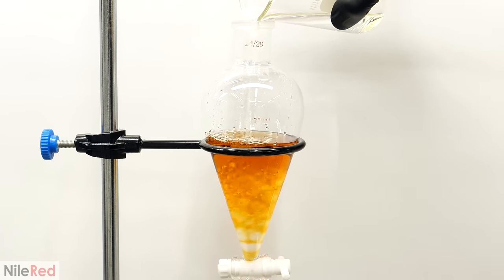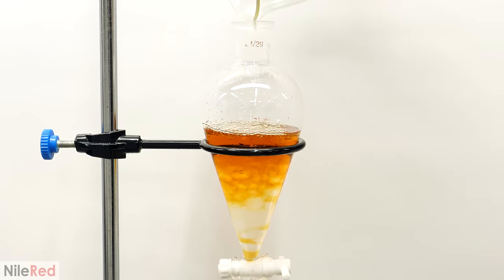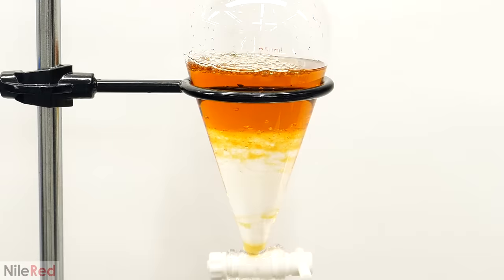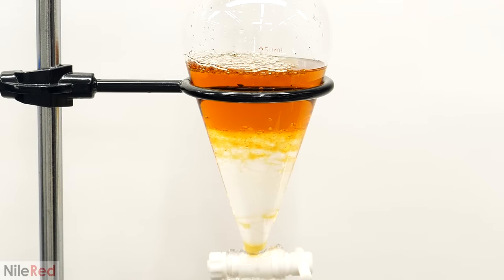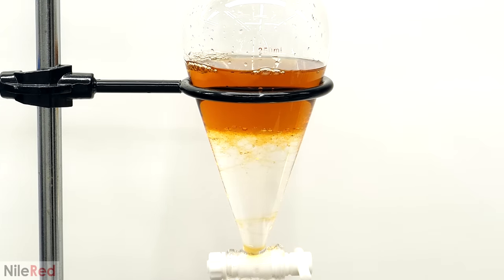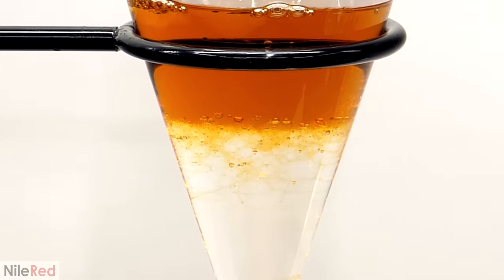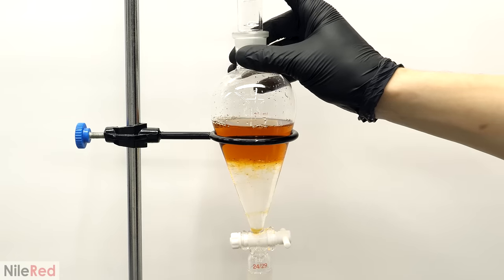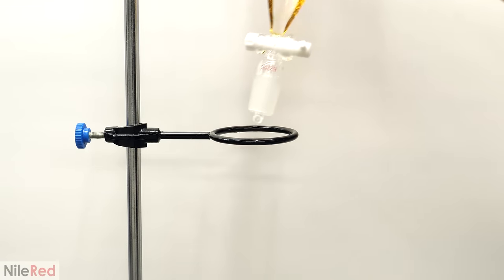The DCM had a much higher density, and it also couldn't mix into the syrup, so almost all of it just quickly sank to the bottom. The idea here was that the caffeine, and hopefully nothing else, was much more soluble in the DCM. This would cause the caffeine to prefer being in the DCM, and it should slowly get pulled from the syrup. But just letting it sit like this wouldn't work very well, because the two liquids are barely touching. To have an efficient extraction, I had to maximize the surface area between the two, and this is usually done by just shaking it. So I sealed the funnel with a stopper, took it off the stand, and I really tried to mix them together.